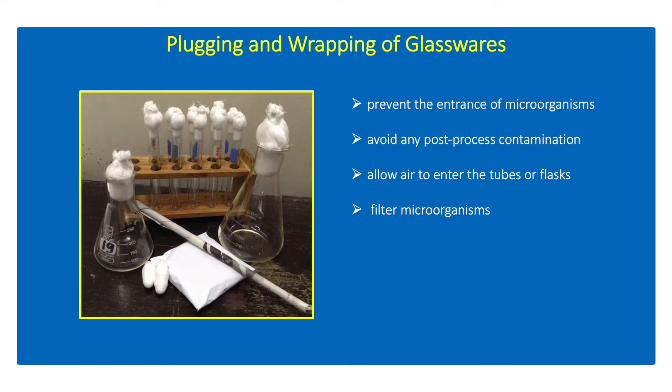Thus, plugging and wrapping of test tubes, flasks, and petri plates will prevent any contaminants from the ambient air or immediate surrounding to contaminate the tools to be used for microbiological analysis.